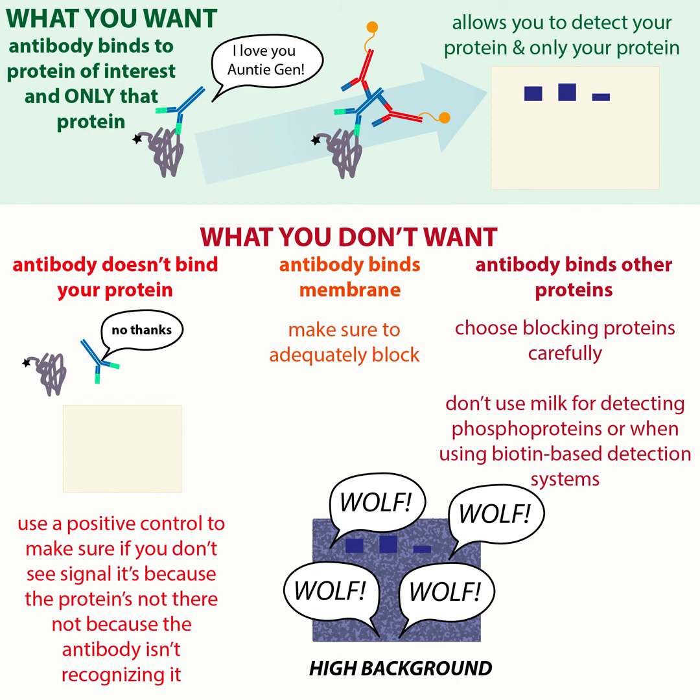Antibodies can also expire, so you want to make sure that you store them properly, because they're proteins, so they can degrade and that sort of thing. So you often store them at -20 or -80. You can also store them diluted for shorter periods in the fridge, because you can actually reuse the solution a couple times.